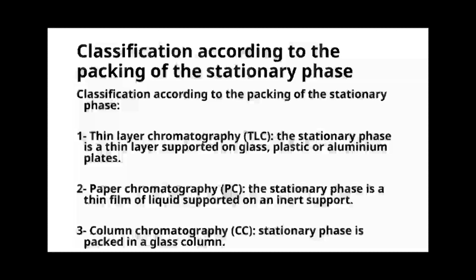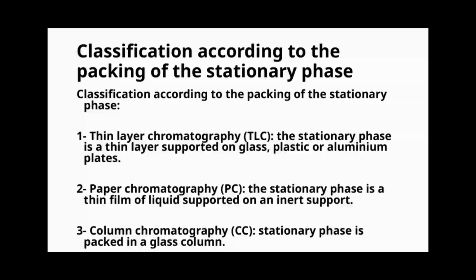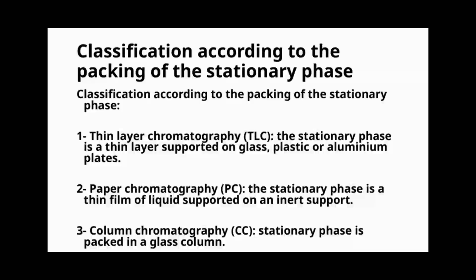Lastly, we have column chromatography, which involves packing the stationary phase inside a glass column. This setup allows for larger sample volumes and is often used for preparative purposes, giving us more material after separation.